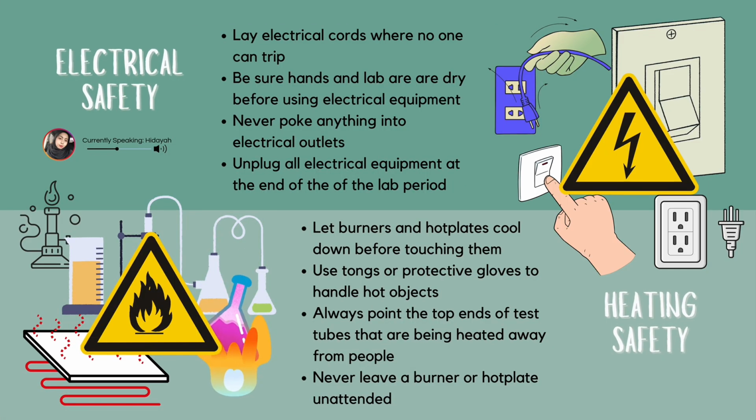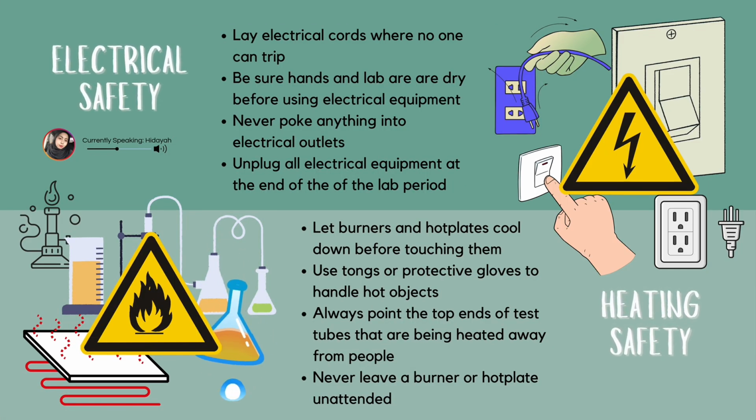For electrical safety, always lay electrical cords where one cannot trip over them. Ensure your hands and the lab area are dry before using any electrical equipment. Never poke anything into electrical outlets and be sure to unplug all electrical equipment at the end of the lab period. When dealing with heating safety, allow burners and hot plates to cool down before touching them.